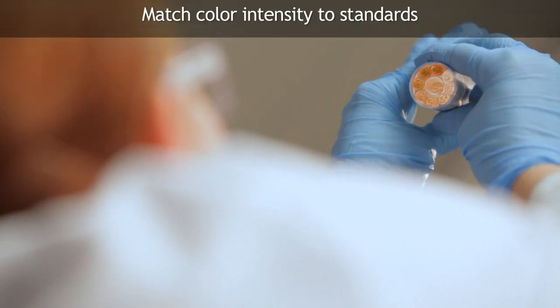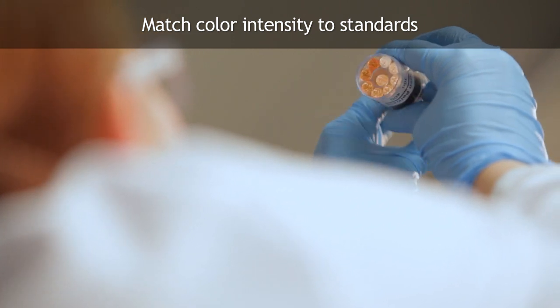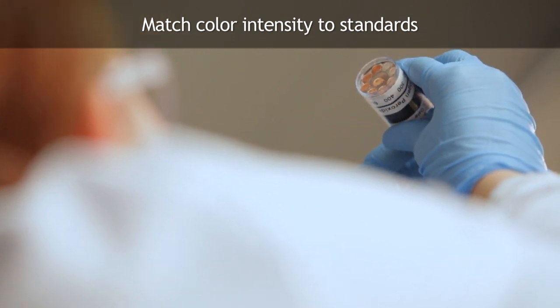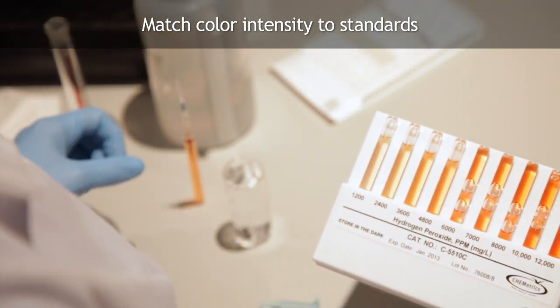Direct the top of the comparator up toward a source of light while viewing from the bottom. Rotate the comparator until the color standard below the ampule shows the closest match. Concentration values are printed along the bottom edge of the comparator label.